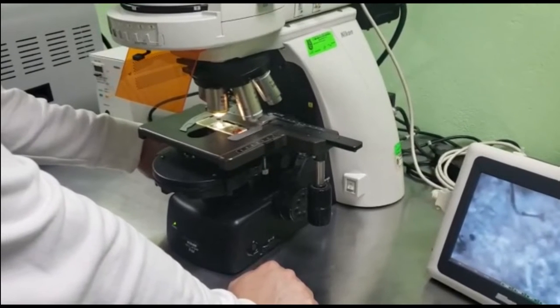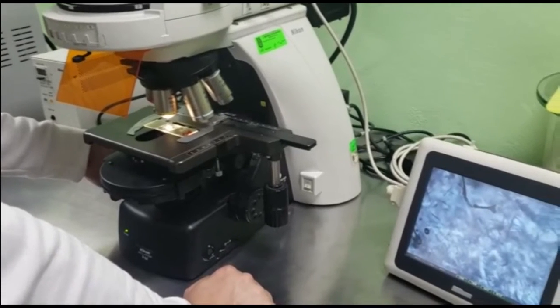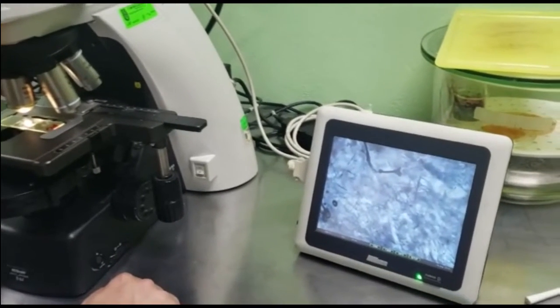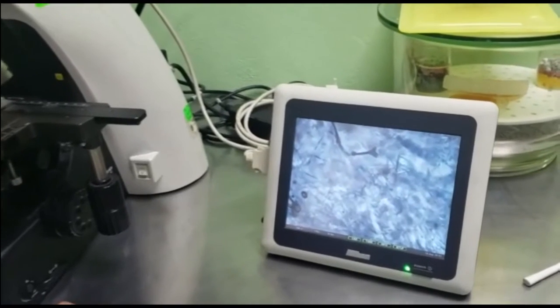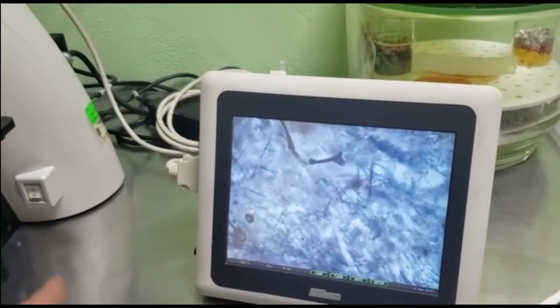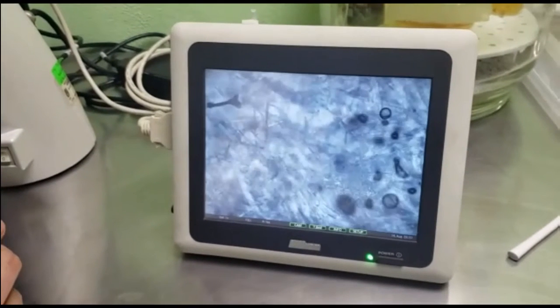That is a very big advantage of this microscope. Also in the LCD screen, as I said before, you can start to put different information and keep it in a USB without having to use another computer or something to keep your samples.